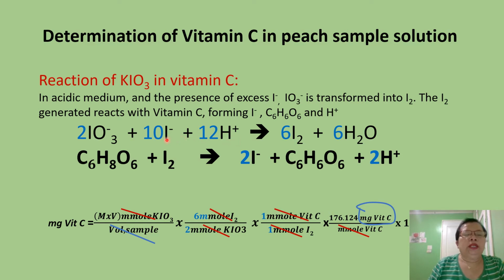Now, our titrant here is potassium iodate, no? But during the redox reaction, only this iodate ion will participate because potassium ion do not undergo change in oxidation number. So, this potassium iodate here, you place this in the 50 ml burette, okay?